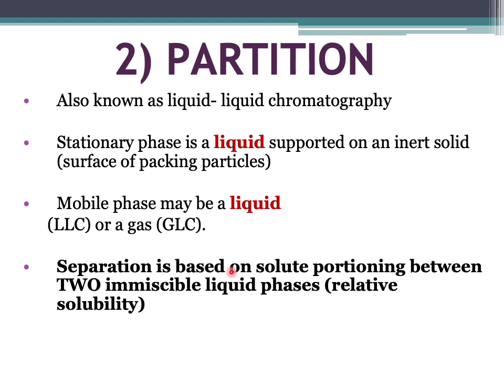Okay, separation is based on solute partitioning between two immiscible liquid phases, or relative solubility. So maksudnya kat sini separation dia adalah bergantung kepada solubility. Okay, immiscible liquid phase, sama ada dia larut ataupun dia tak larut dalam liquid pada permukaan stationary phase tu. Okay, dia bergantung pada keterlarutan dalam liquid pada stationary phase tu. Liquid yang ni lah, liquid supported pada stationary phase.